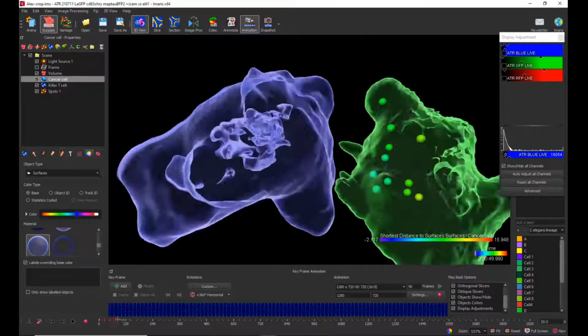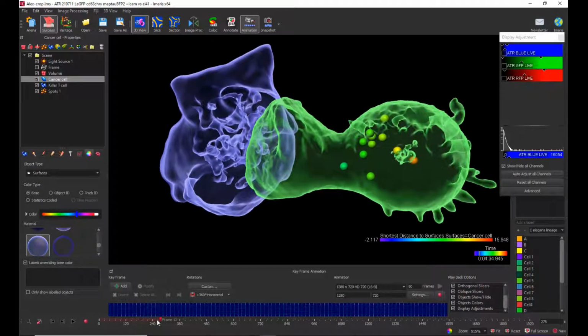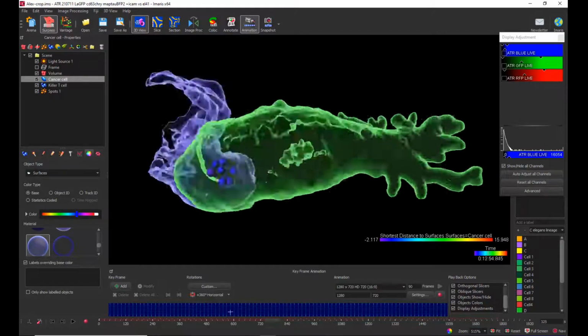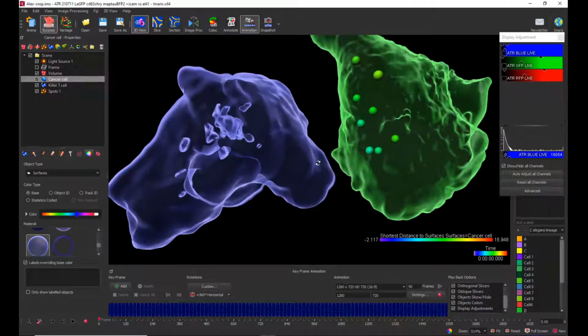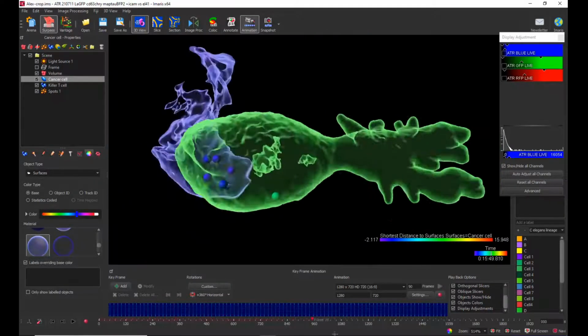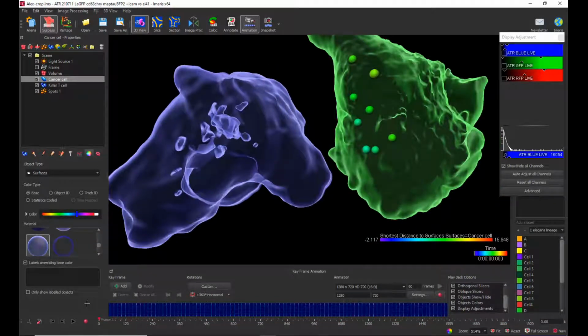So let's have a look at my, okay, so here in this example it's important to keep them in the field of view because they are changing their orientation pretty significantly. Okay, let's do it like this. So now I will do it a different way than previously. I'll start with adding a rotation.